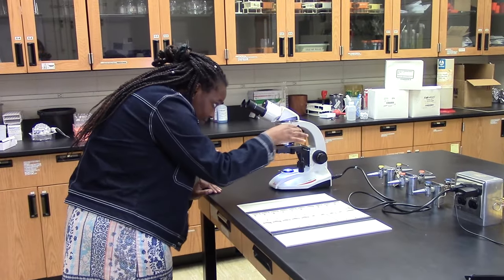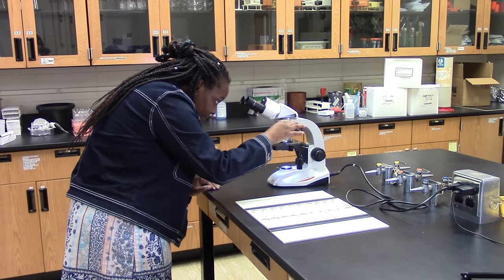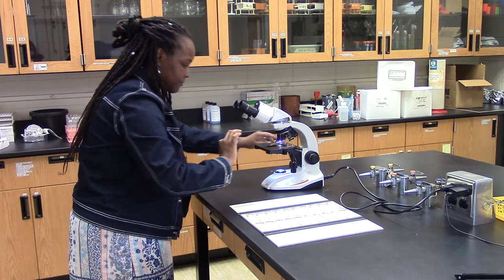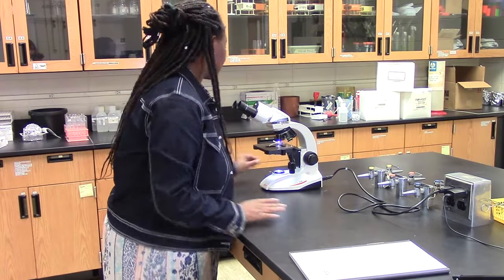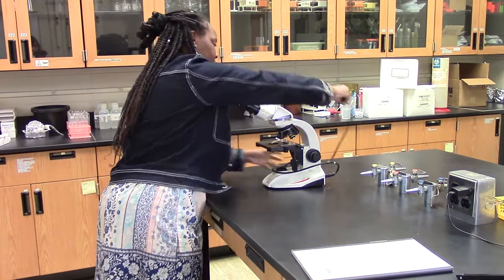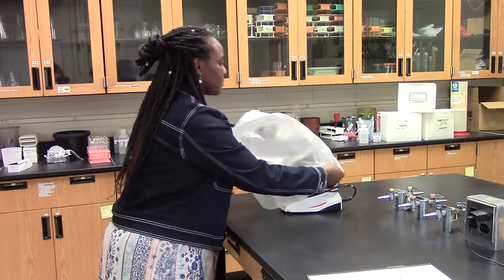The cleanup routine is very simple. Rotate your lenses to the 4x magnification. Place your slide back where you got it from and make sure you're careful handling it. Hit the off button, unplug, wrap your cord around the arm, and be careful placing your microscope back to where you got it from.